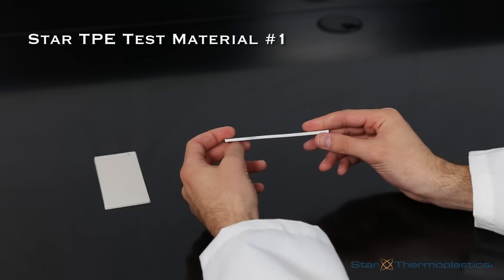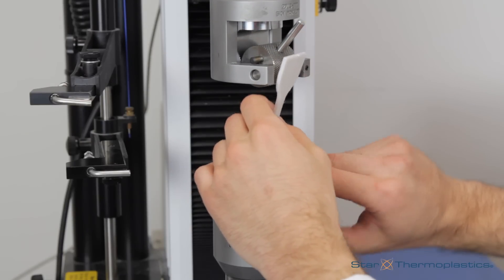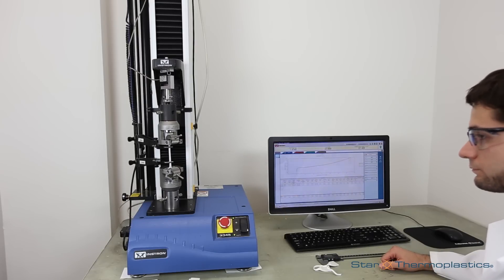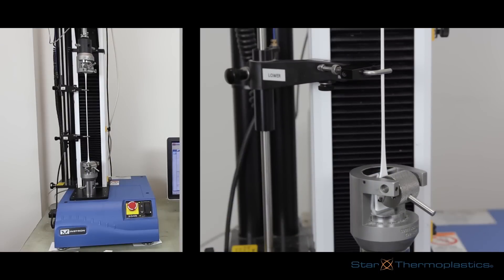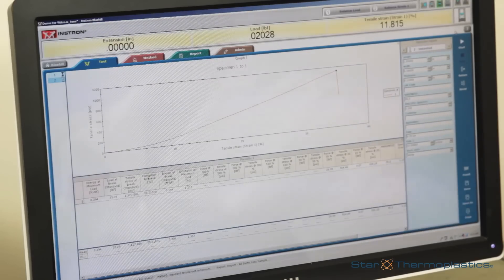The first material we have chosen to test is a star TPE material with a very high tensile strength, such as what you would see in a strap to secure a bicycle to a car carrier. Wow, that was quite a stretch, and a very high tensile strength result as well.